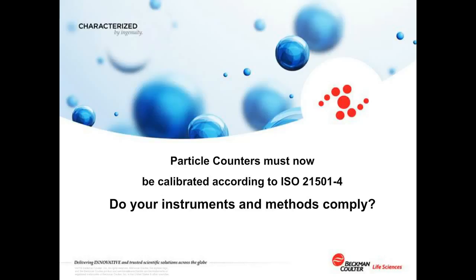Particle counters must now be calibrated with ISO 21501-4. Do your instruments comply? Presented by Joe Gecsey, the Life Science Application Manager at Beckman Coulter Life Sciences PCC, Particle Counting and Characterization.